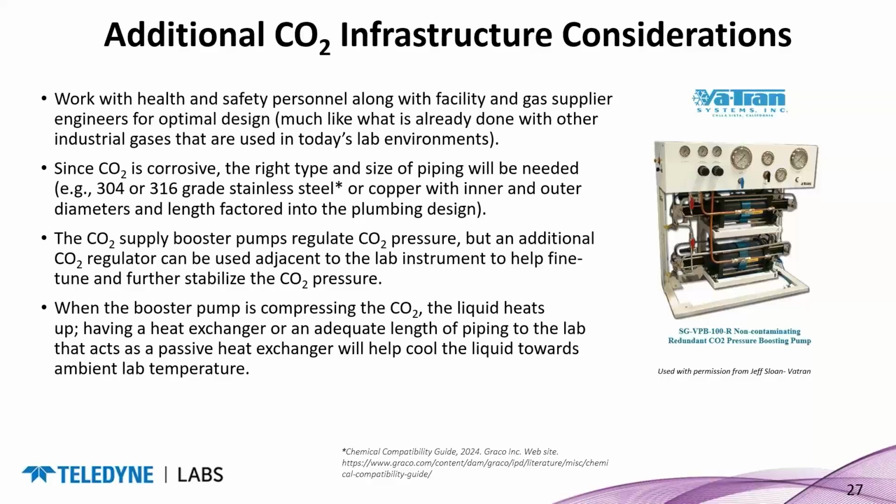Heat is built up at the booster as well, so that does heat the CO2 when you're pulling it out of a larger container. So either if you have a long run of piping, it'll cool toward ambient by the time it reaches your instrument, or you may have to add in some sort of heat exchanger to force that near the source of the booster pump.